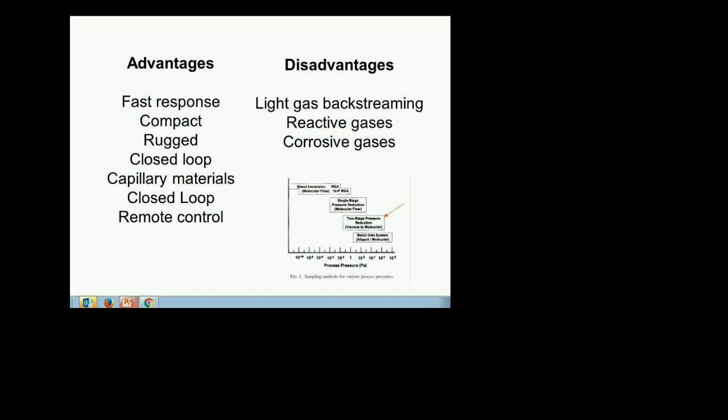Unless you have the cold cathode gauge right next to the ionizer of the RGA or right next to the detection region of the RGA, I doubt that you're having any problem. So it is a no-no if you don't know if it is a problem, but it's so easy to test. In fact, since you can remove the magnet, turn on the RGA, remove the magnet, and then bring the magnet to the RGA until you do see a problem.